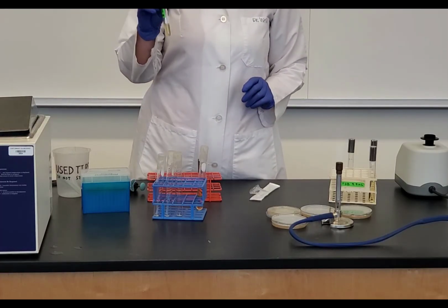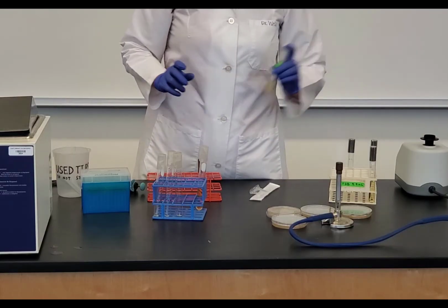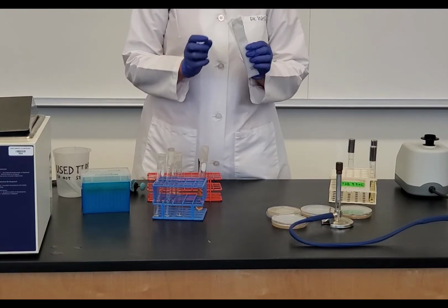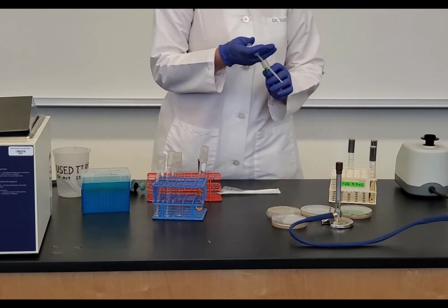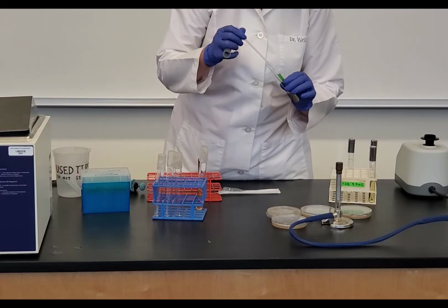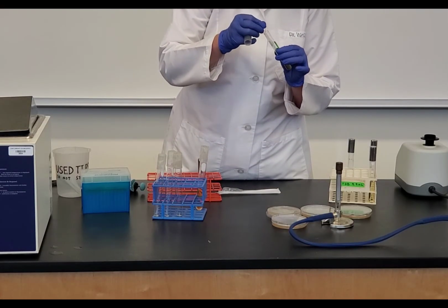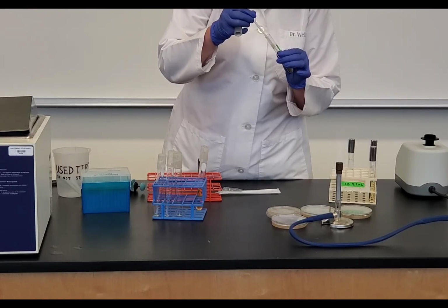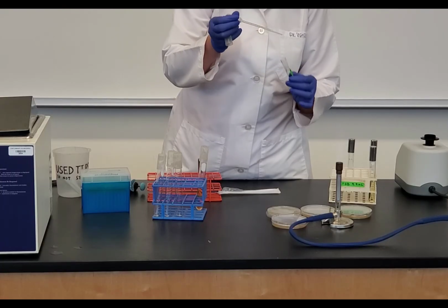I need to add my E. coli to this tube, so again, I'm going to vortex. I'm going to get my transfer pipette again. Every time I go into the tube, I've got to flame the opening. So flame the opening of the tube. Go in and draw up 0.5. Okay, and I can release it into the pipette. I don't have to hold it there.